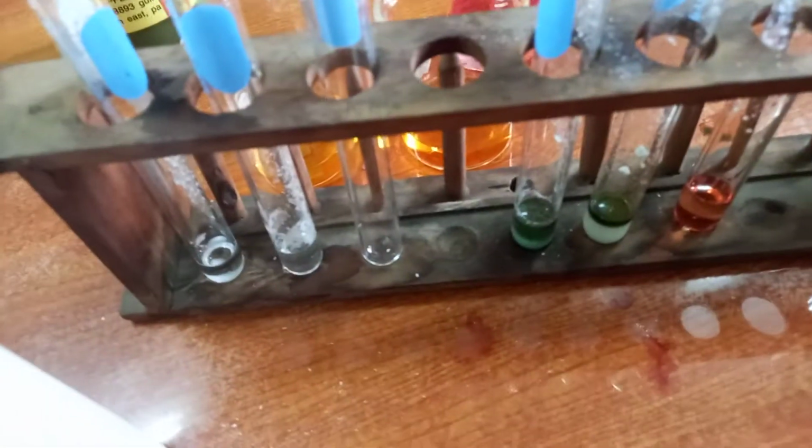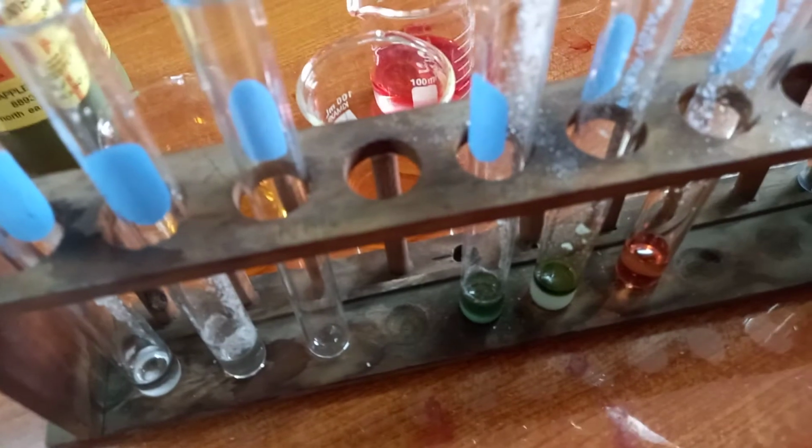So you can see that the aldehyde, even though it has acidic properties, is very weak because it was neutralized quickly, so we get the green color. All right, remember it was red and it changed to green very quickly. But for this one, we added about 3 spatulas of the sodium carbonate before we got the green color. Let me do the same for our known carboxylic acid.